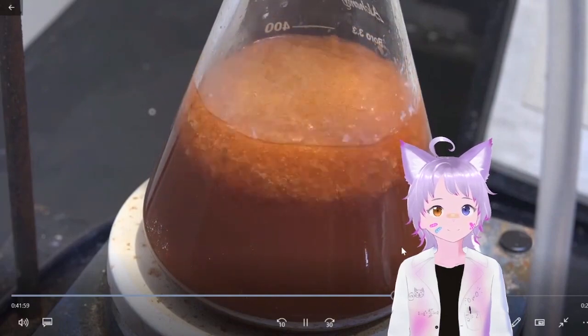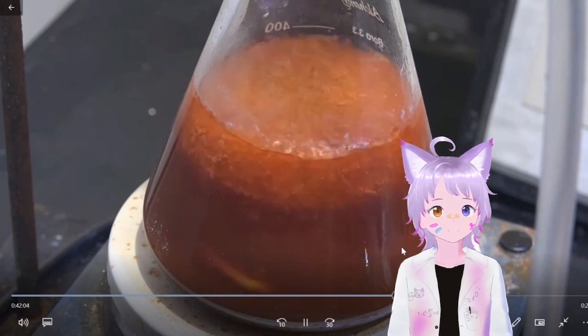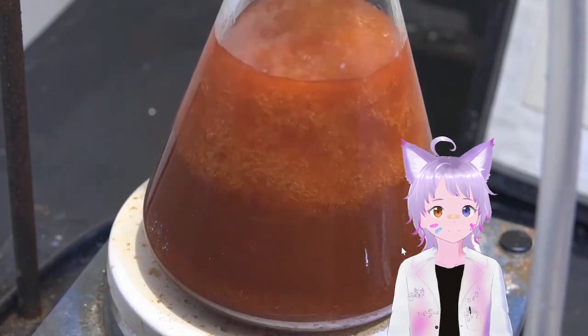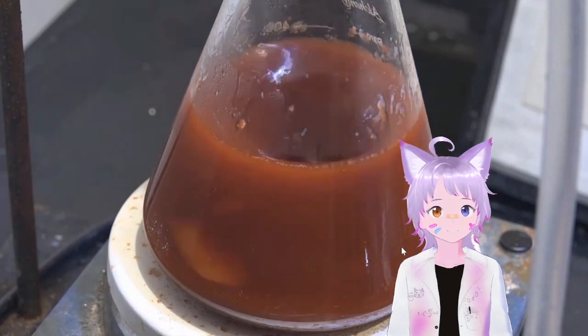Anyway, it's no secret I've been trying to do this reaction for the past 8 months and always failed. I was almost ready to give it up when I posted my problems here on YouTube, and a number of you saw right away what was causing my failures. I was working on too small a scale.